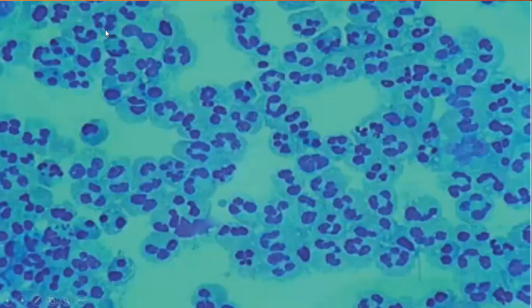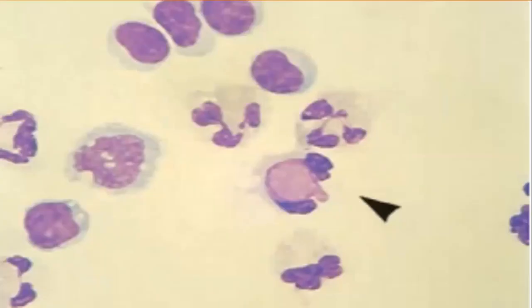Then this is a Wright-stained smear from the synovial fluid of a patient with septic arthritis. Notice the predominance of segmenters or neutrophils. So this is an LE cell. Notice the neutrophil with ingested cellular nuclei component. Okay, an LE cell.